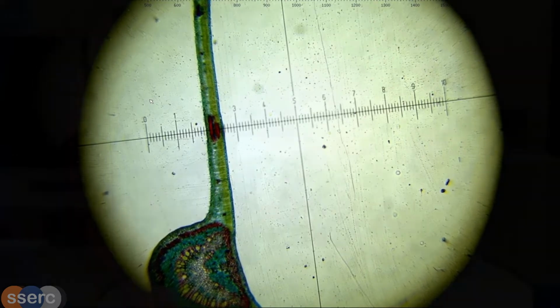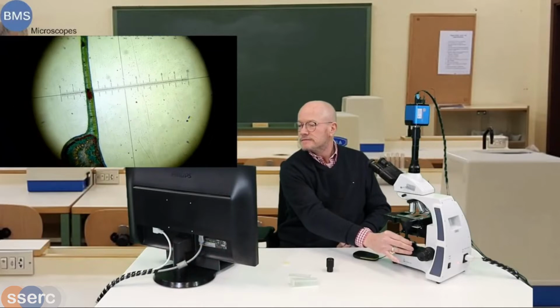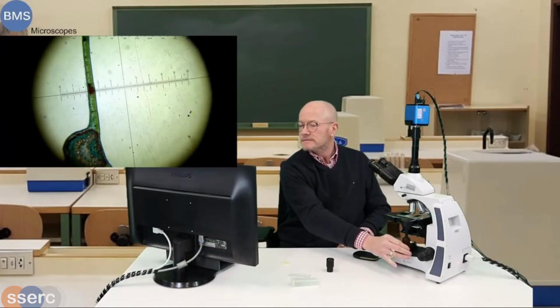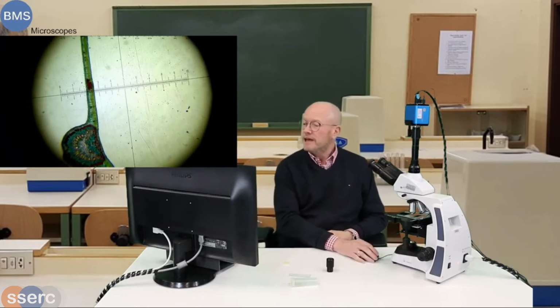Well, let's put it in line as well as possible. And if I measure now from here, from 2 all the way up, it's about 6, isn't it? It's 6 little stripes. So 6 of those little stripes I can see right now in my eyepiece graticule.